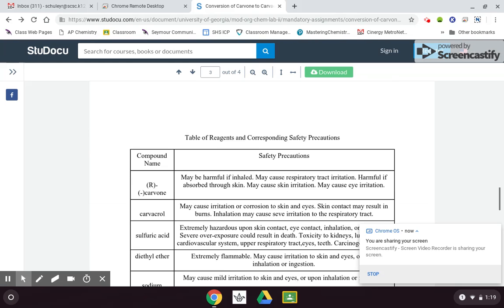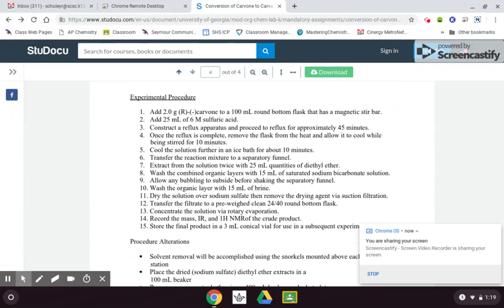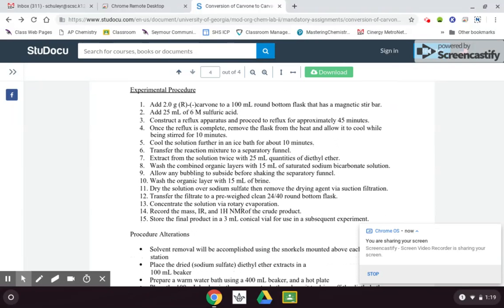These are not your directions that I'm using here, but they are pretty close. I believe we're going to use even the smaller round bottom flask, but if it's not the 100, just go by your directions. We're going to make one modification. Don't go by these amounts.